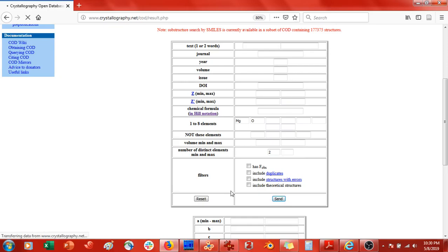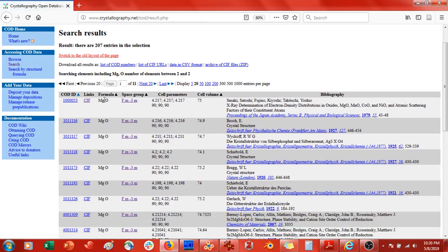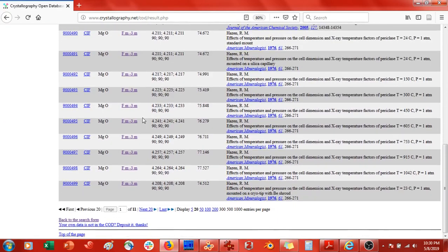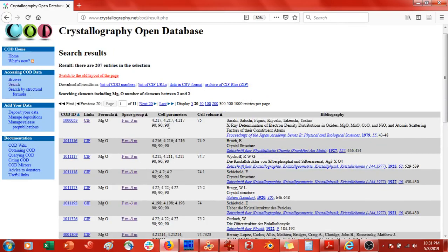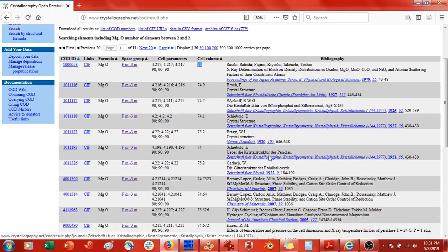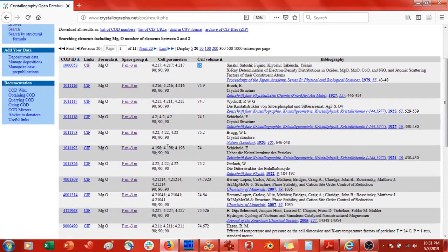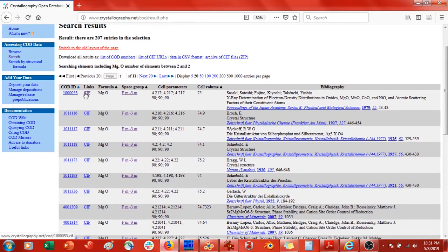Then press Send. It's going to show us the formula, the space group — like FM3M, which is the face-centered cubic FCC crystal — the cell parameters, the angles between each of the axes, the cell volume in Angstroms, and the reference, which is very convenient if you're doing research. Let's click on one of these entries.